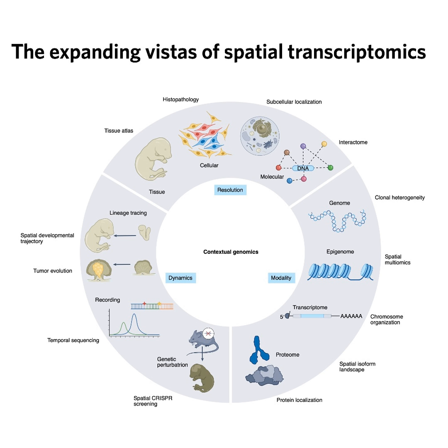You mentioned the traditional hurdle for fluorescence imaging is the spectral limit. You can only reliably distinguish maybe 5, perhaps 10 different colors at once. How on earth did IST get around that to read out potentially thousands of different genes? Yeah, that was the fundamental challenge. And the key strategy they employed is essentially using time to overcome the limitation of colors. They achieved this really high multiplexing by using multiple sequential imaging rounds and relying on some very clever combinatorial coding strategies.